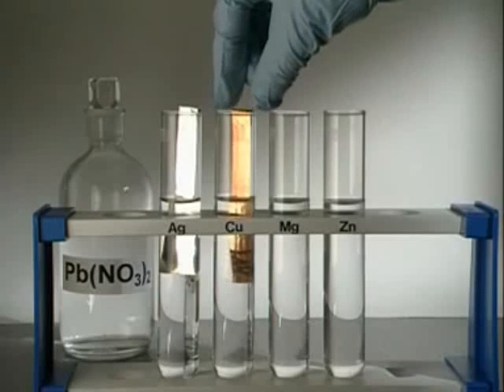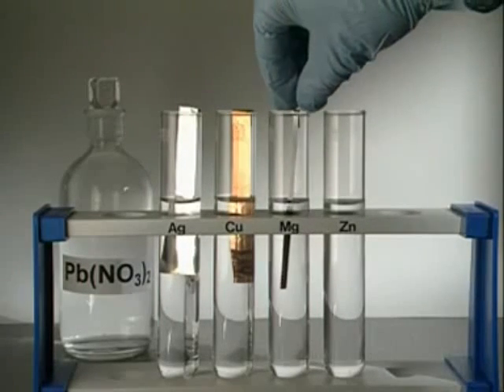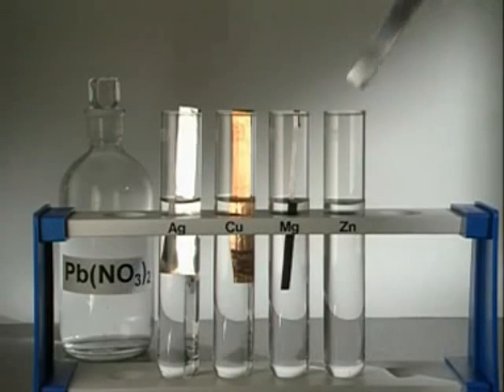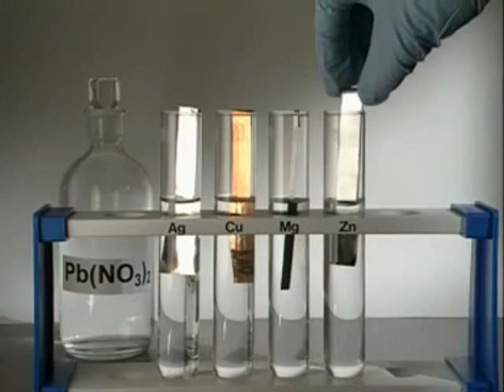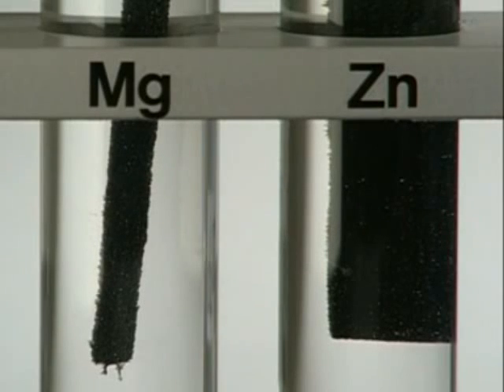Placing the metals in lead nitrate solution provides our first clue. Silver doesn't react and neither does copper, but magnesium and zinc both become coated with a dark grey layer of lead.